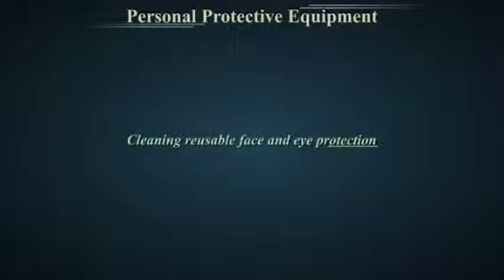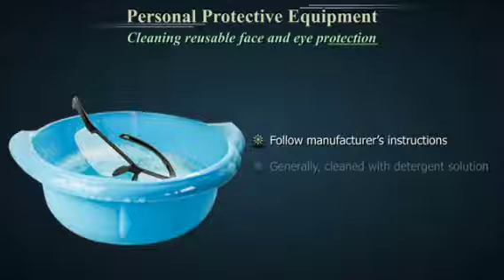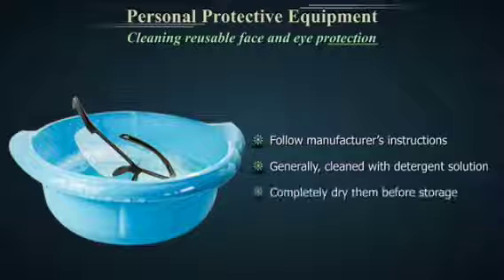Cleaning reusable face and eye protection. Follow manufacturer's instructions. Generally clean with a detergent solution. Completely dry them before storage.